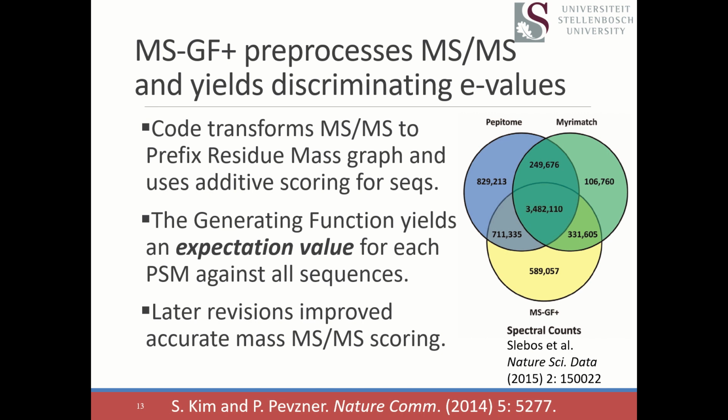When you have an e-value rated metric in bioinformatics, you're always hoping for lower is better. It says what number of results I would have expected by random chance to have produced a score this good. Zero is your best case. I mean, driving the limit is 0.